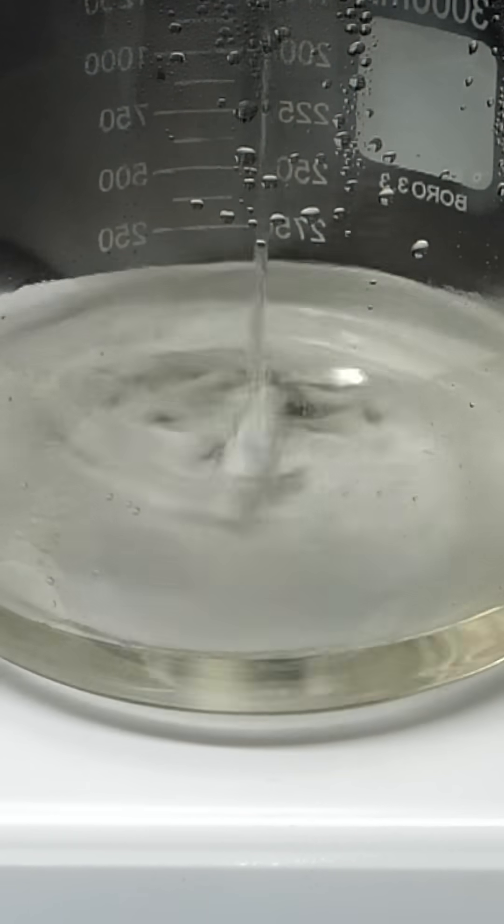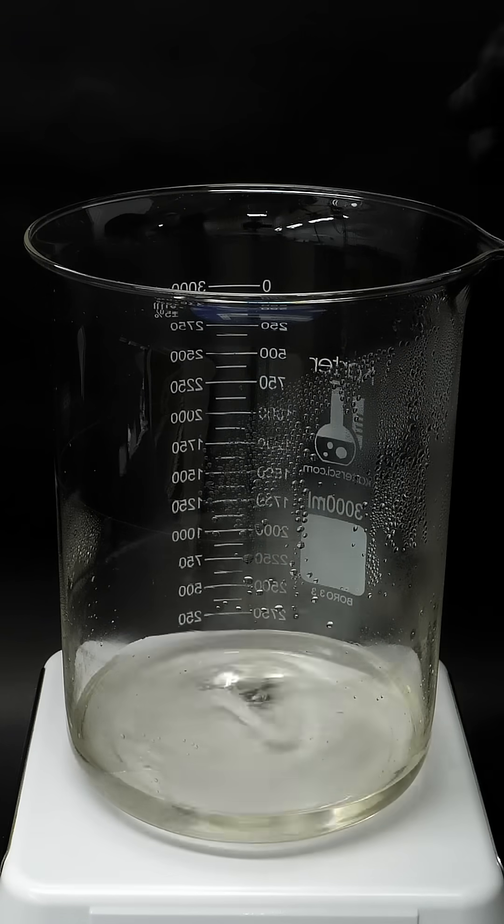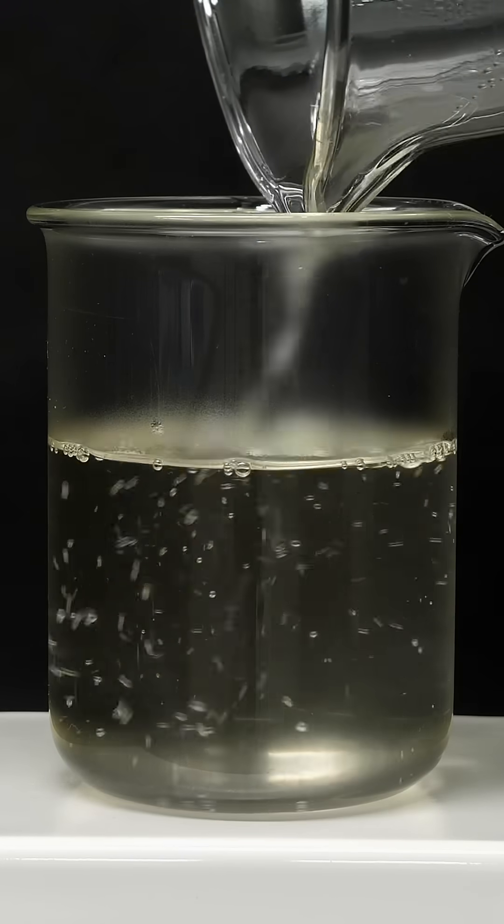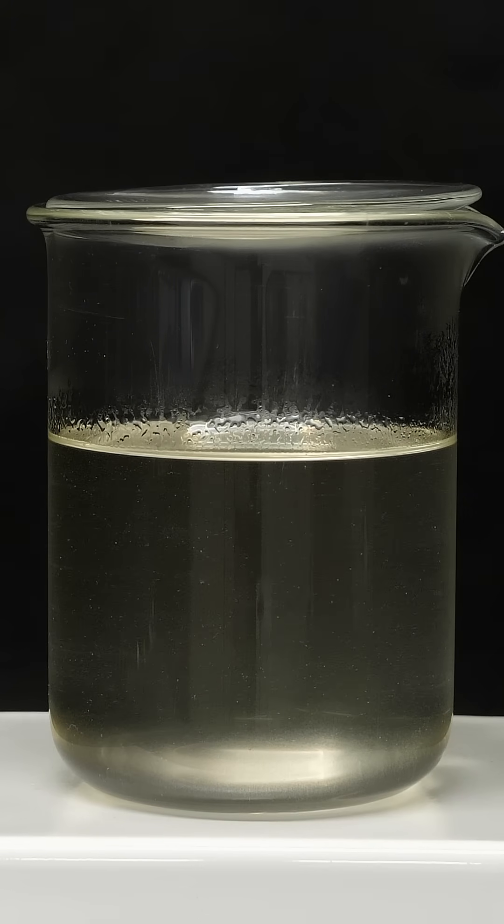So now, all I have to do is add a small amount of vinegar, and I can finally take it off the hot plate. Then, what I have to do next is just pour it all into a smaller beaker, loosely cover the top, and wait for it to cool down.